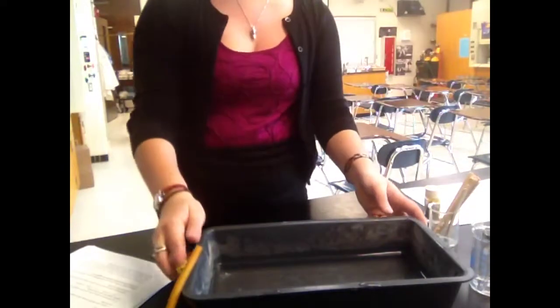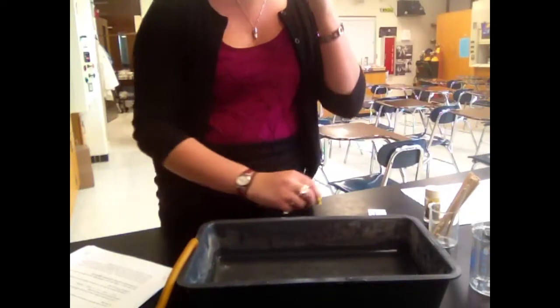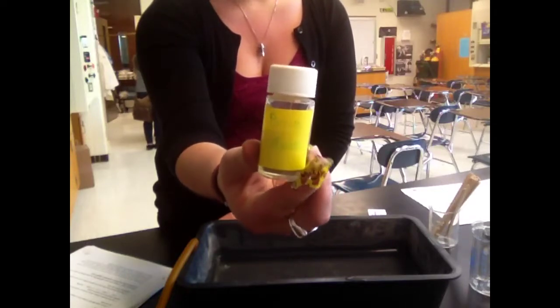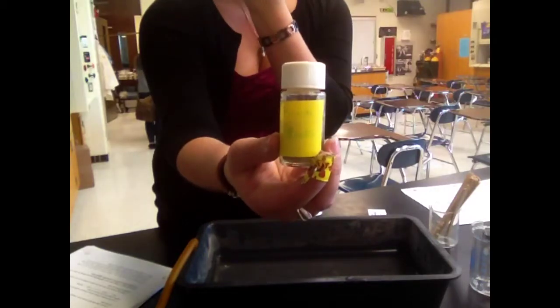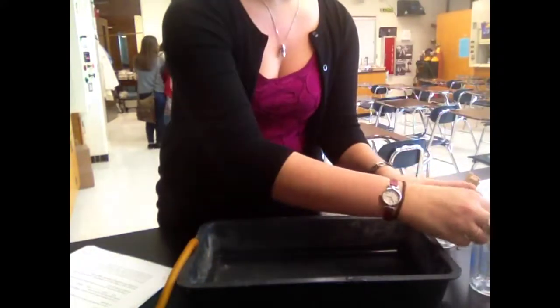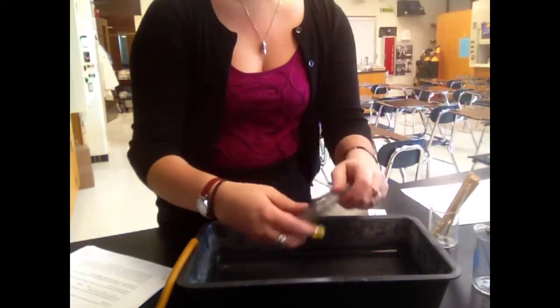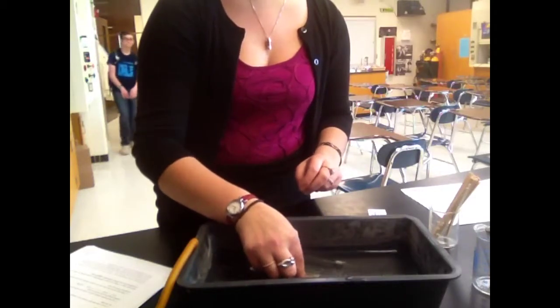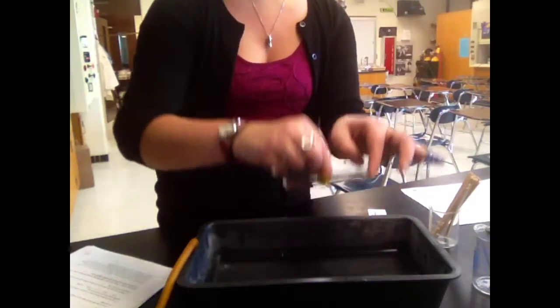So what we have here is this tub. It's a trough and it's filled with water. And then we have this chemical here, calcium carbide. Calcium carbide, when it reacts with water, produces acetylene gas, which is the same gas that's used in blowtorches. So what we're going to do is take these three test tubes and put them into the water trough and fill them up with water by displacement. Once we fill the test tubes up with water, they're going to be completely filled.